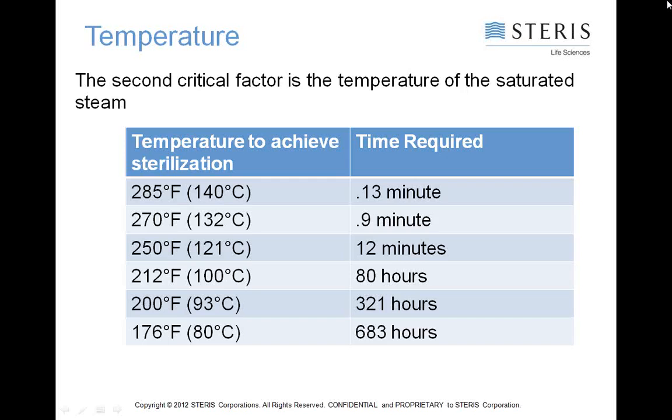In many lab environments, if you subjected some of glassware or cages or our typical things that we're sterilizing at higher temperatures, they tend to degrade. So 121 for 20 minutes is kind of a standard sterilization cycle.